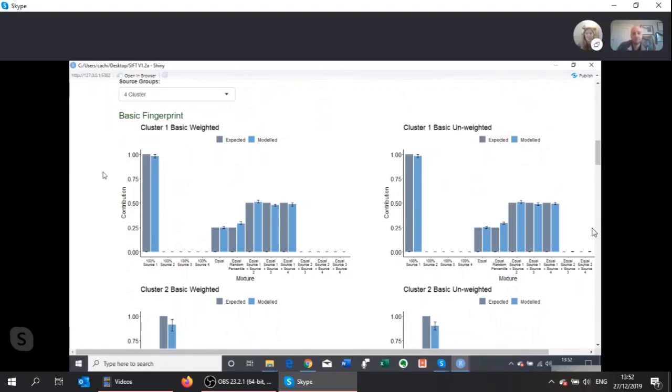Yeah, they're really similar. I must admit, when I've run this software before, I don't tend to get such a good result for the 4 cluster one, and I tend to get a lot better for the 2 cluster one. So this shows if you try running it twice, you're probably going to get slightly better or worse discrimination. It really is worth just trying it multiple times.